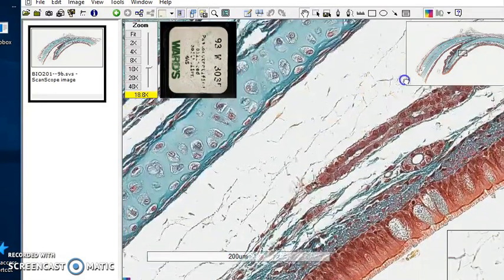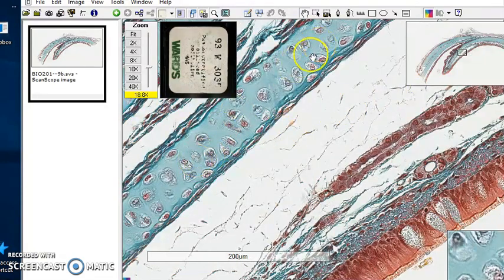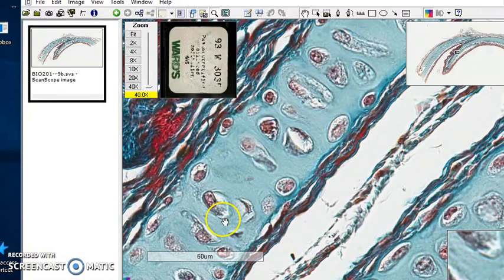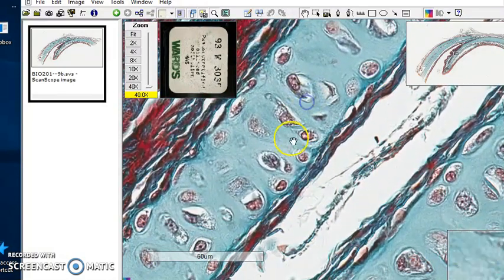All right, what else? The other classic thing to see in a trachea is hyaline cartilage. So this is a connective tissue. You can see the cells are widely spaced by this matrix that stains this bright blue. There's a cell inside each one of these spaces. The spaces, you'll recall, are called lacuna. One is a lacuna. If you have more than one, they are lacunae, A-E, as its ending.